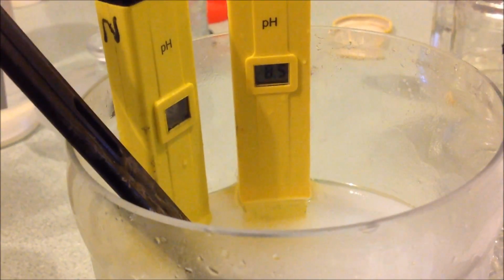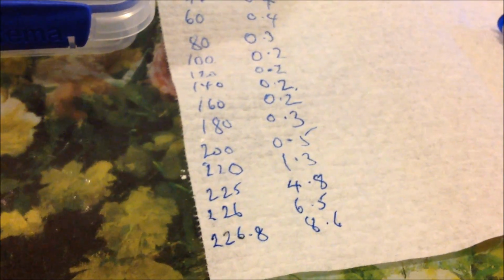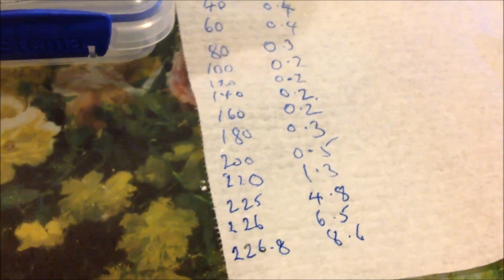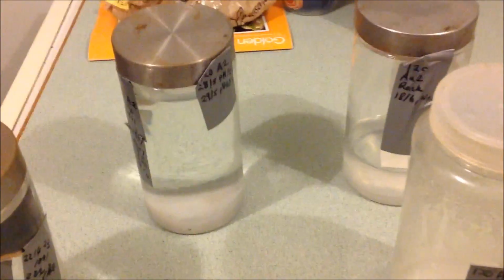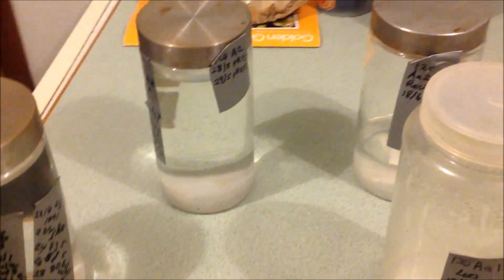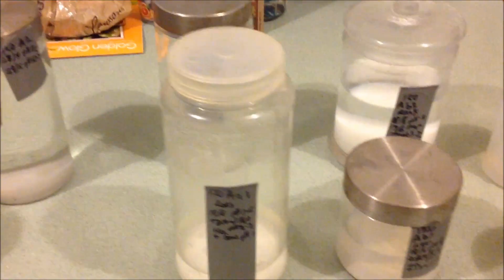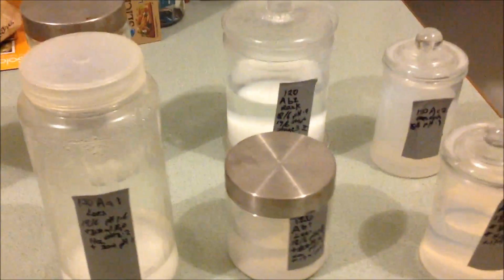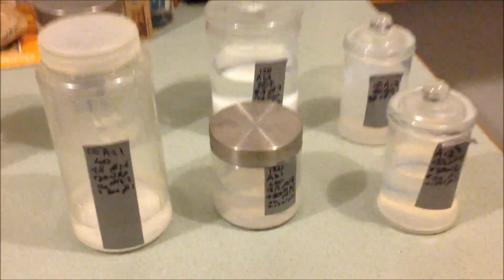And now sitting on 8.5, 8.6, and we're looking at 226.8 mil. Well, the time has come on a botched 3-stage precipitate, where on the first stage I ended up with a nodule, which I carried in a separate line to dissolve that or get any possible M state out of it. And a 3rd stage which botched up itself, went over, what you get when you're not watching.